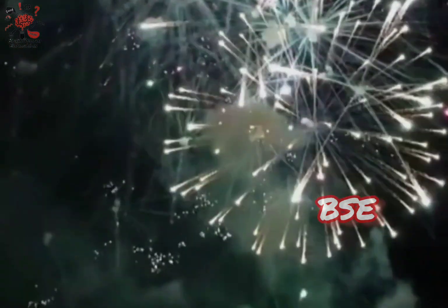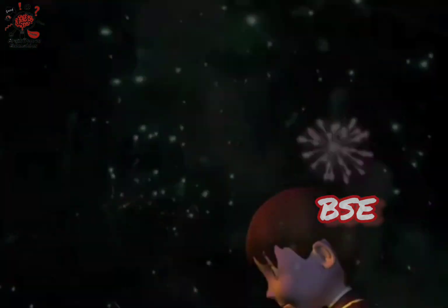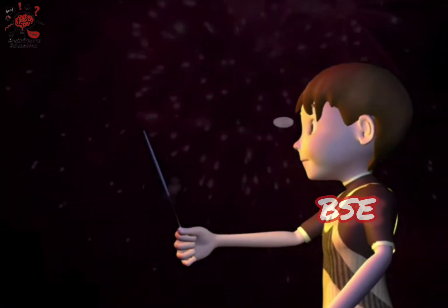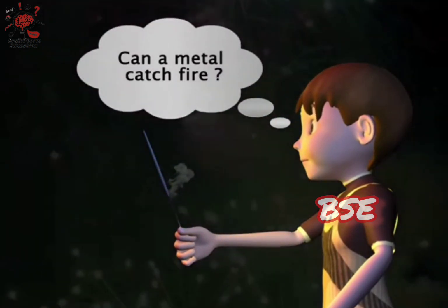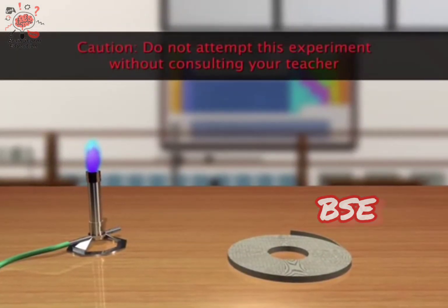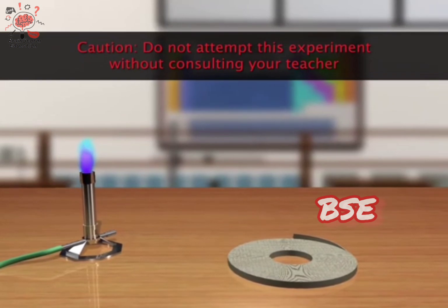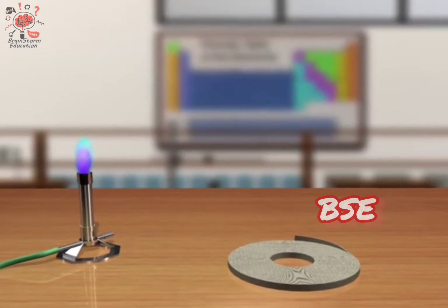We light sparklers and crackers during celebrations. Do you think metals can catch fire? It is safe to conduct this experiment in a fume cupboard, using proper goggles and a Bunsen burner.